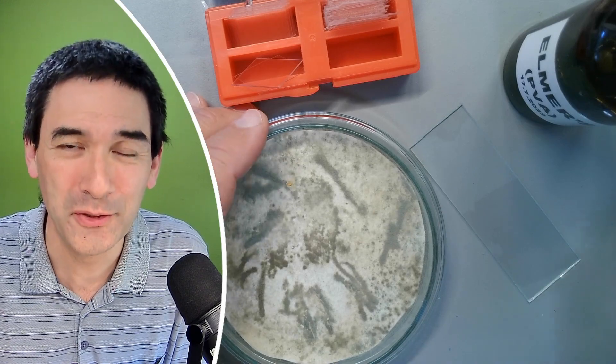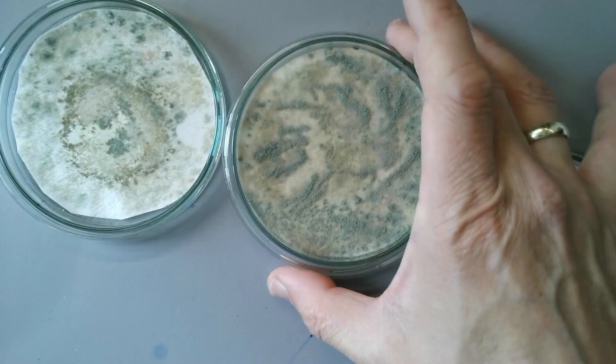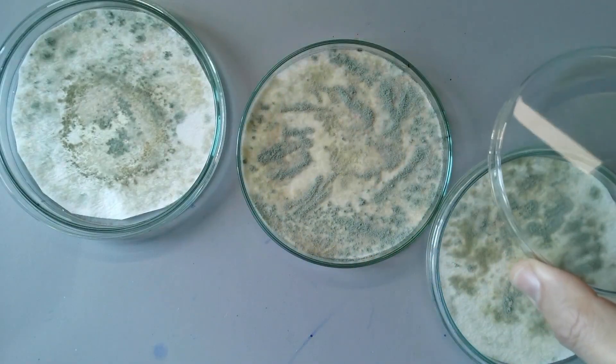Hello and welcome again. Microbe Hunter here, and today in this video I'm going to show you how you can make a permanently mounted microscope slide of fungal spores.